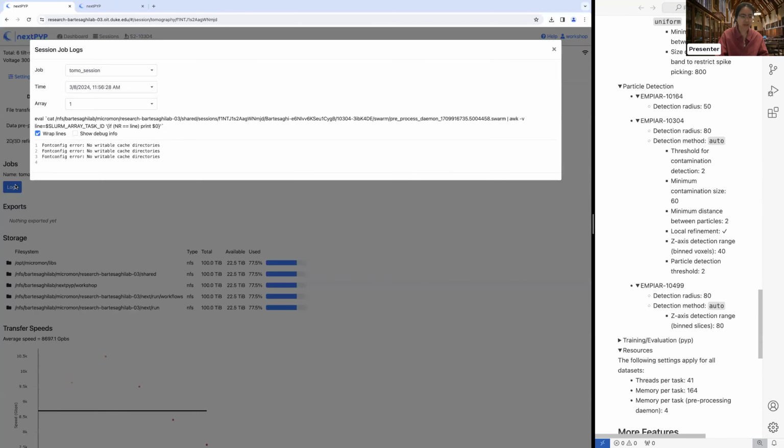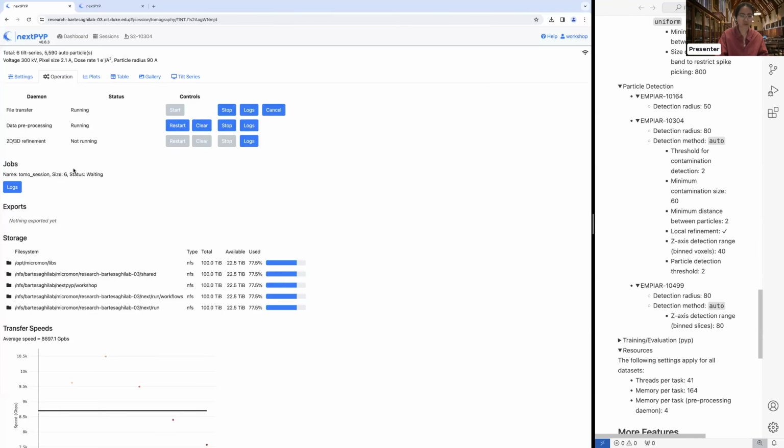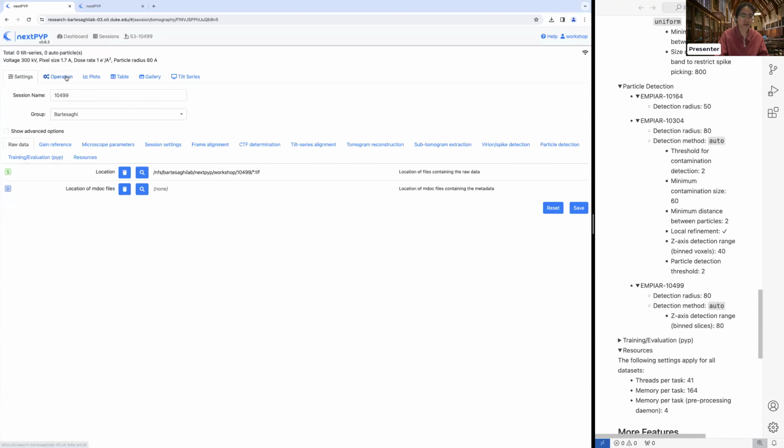And you can check the status here. This one will still show the output from our previous sessions, but once this job finishes running, you can then navigate and see the log outputs from there. While this job is waiting to be run, let's see whether this one is finishing.